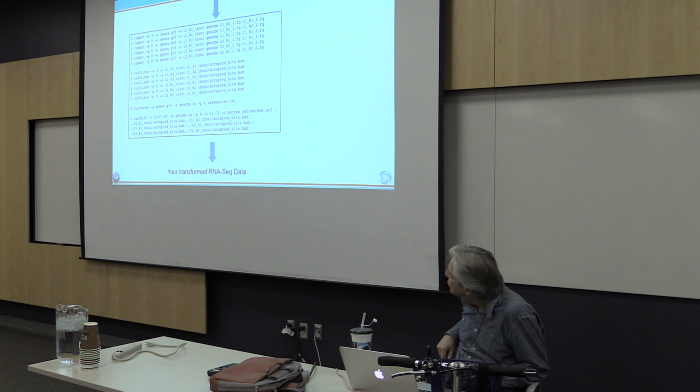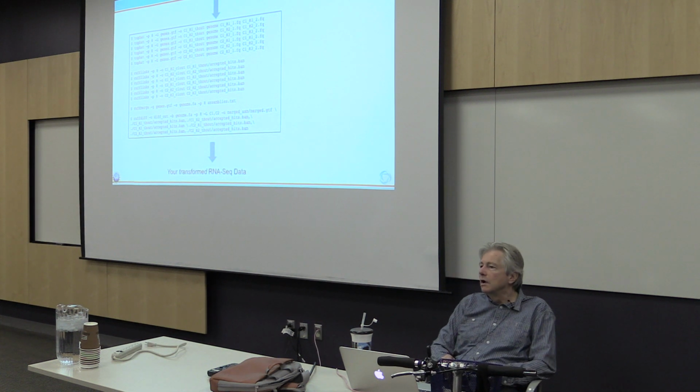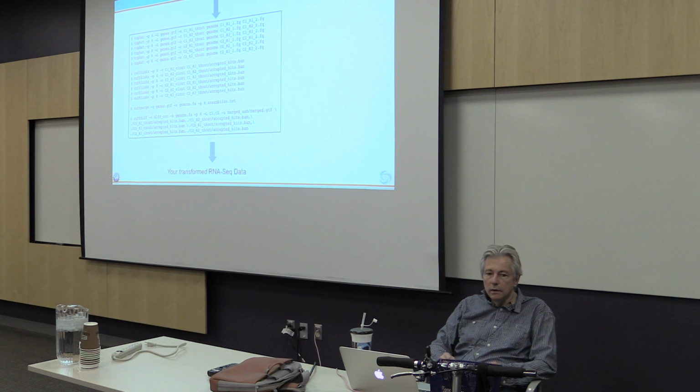And just as a sample, this is sort of what you would do at the command line if you did this on the command line. Some of you are familiar with working on the command line. Some of you aren't. Some of you may have a system where you can work already, and Bowtie and TopHat, or TopHat, Bowtie works within TopHat. But TopHat, Cufflinks, Cuffdiff, Cuffmerge, they're all already installed, but a lot of you don't.